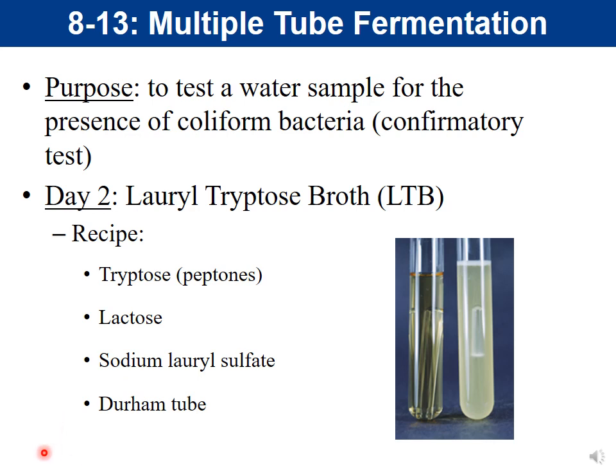So now let's talk about what our results would look like in the LTB broth. So there are a couple possibilities. Here on the left, this tube has no growth and no gas. So let's say we had added water to this and we got that result, right? No growth and no gas. Does that mean that our water has no bacteria? The answer is no, it does not mean that it has no bacteria, because again, the only thing that can grow is gram-negative.